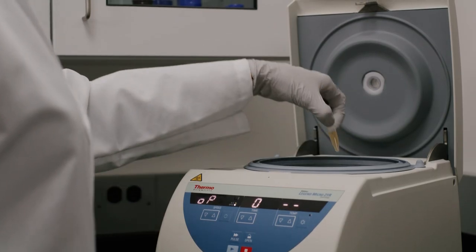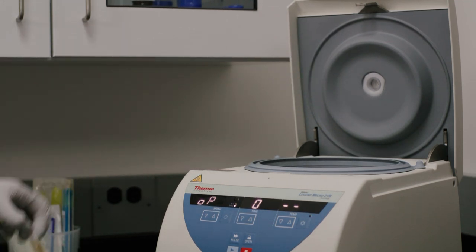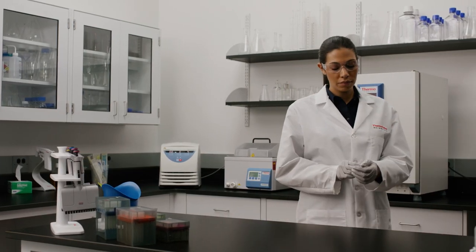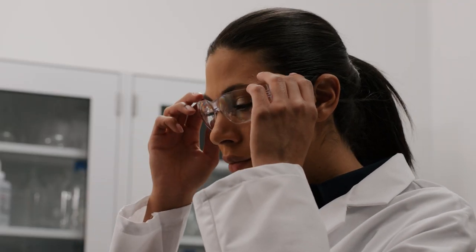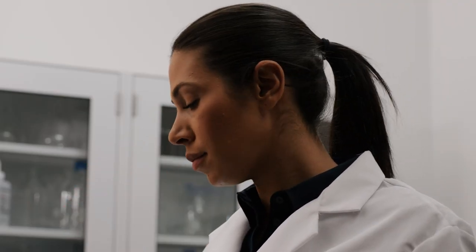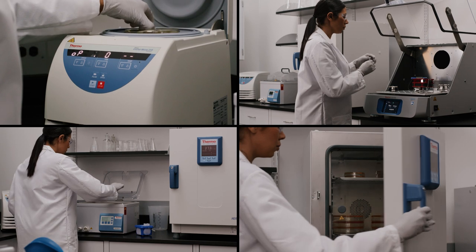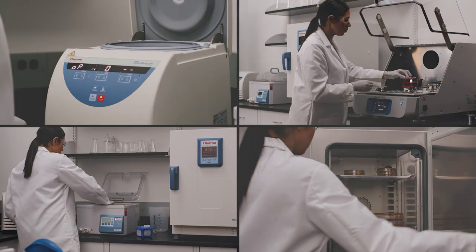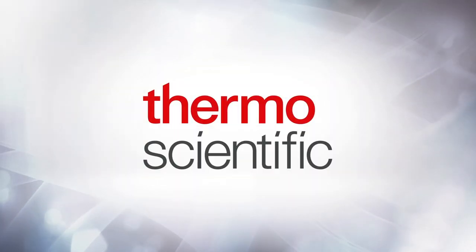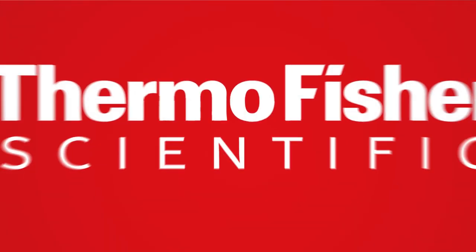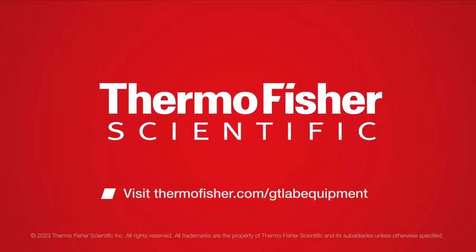Once Maria's DNA is prepped, she'll be ready for downstream processes like sequencing for further characterization. And just like that, Maria completed her DNA cloning protocol using exclusively ThermoScientific products. Visit thermofisher.com/gtlabequipment to find what you need to do the same.